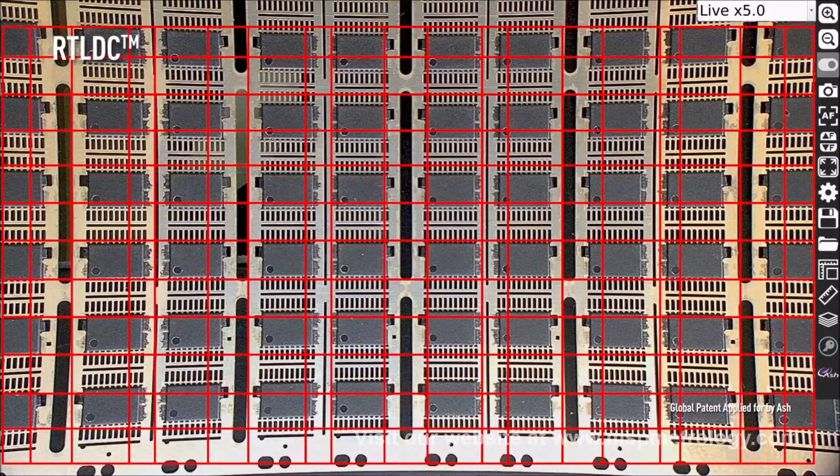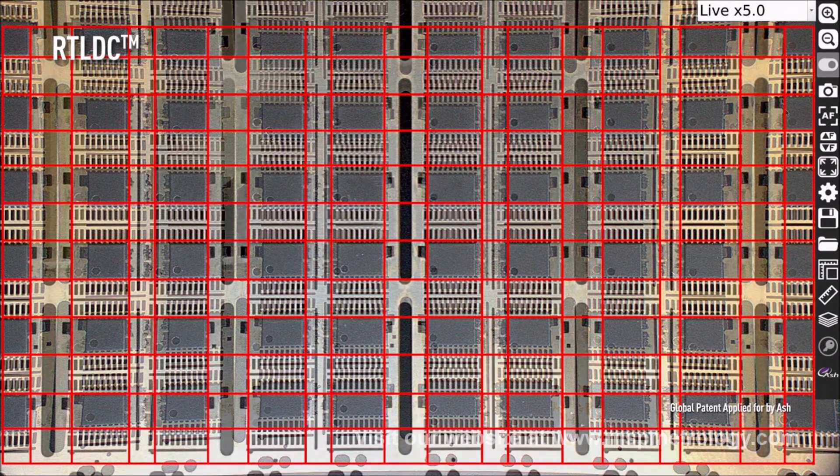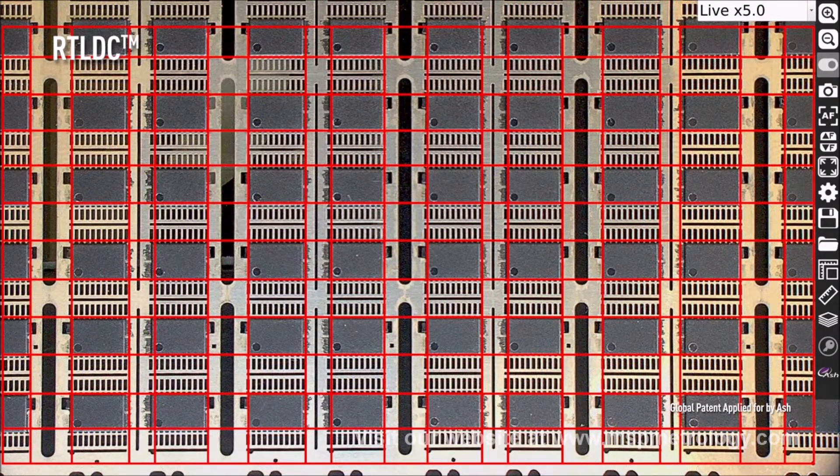The InSpecs 3 incorporates enhanced real-time lens distortion correction, utilizing our new ASHCAM module, allowing inspection of a true representation of your sample.